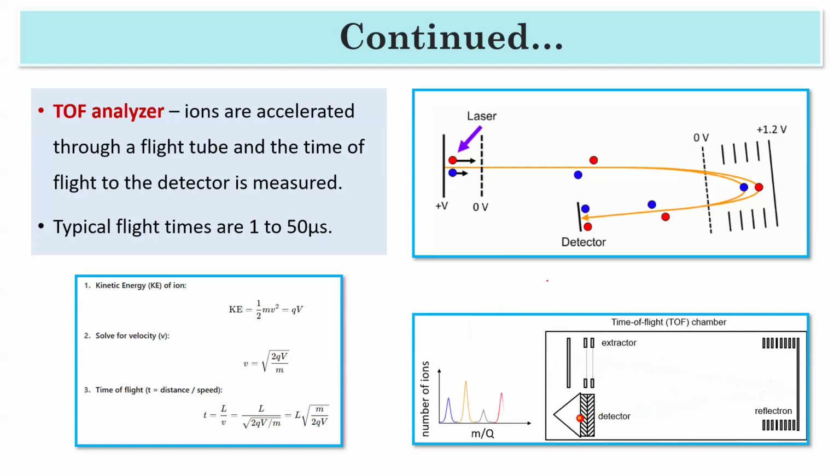Okay, now I was talking about what is this? This is the reflectron. So sometimes what happens?